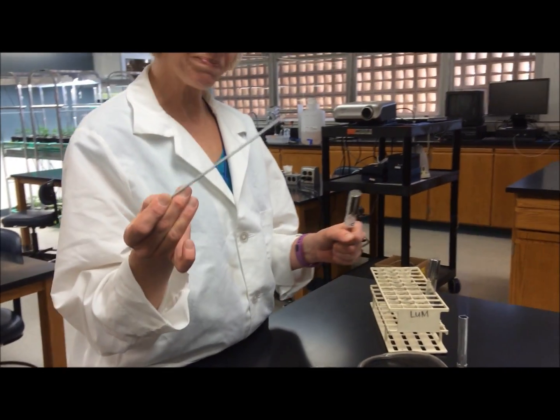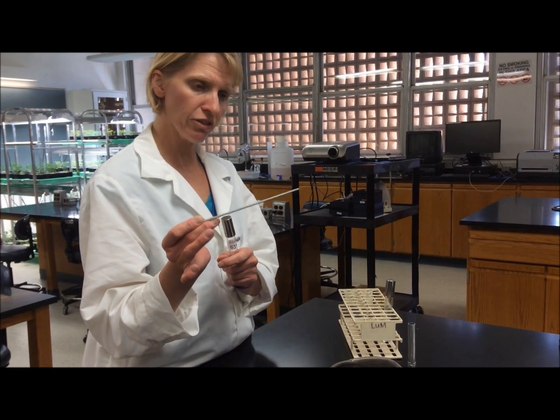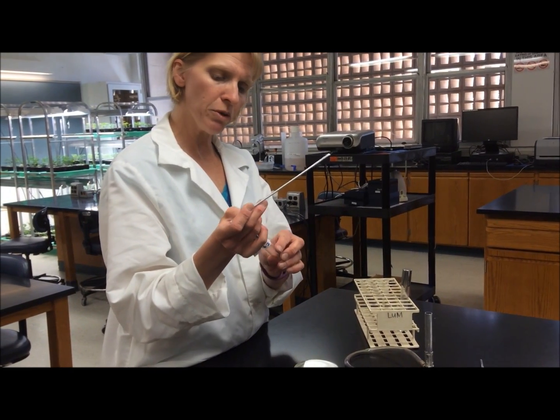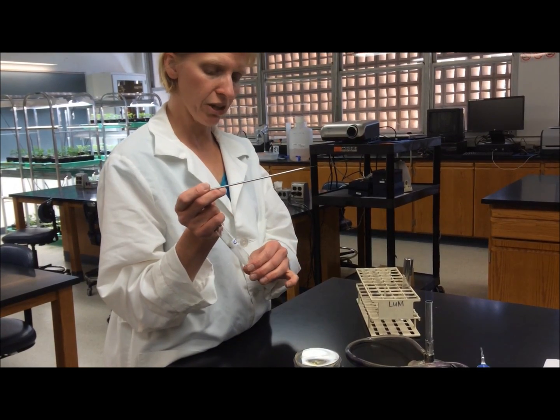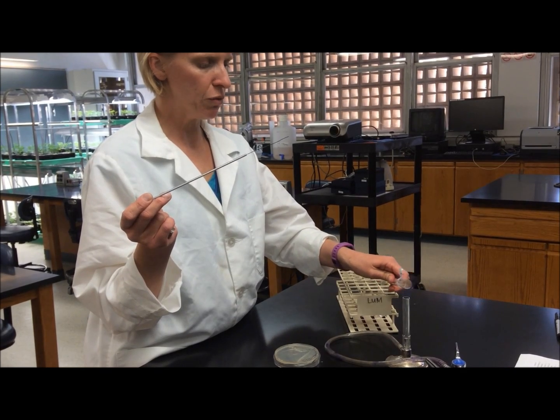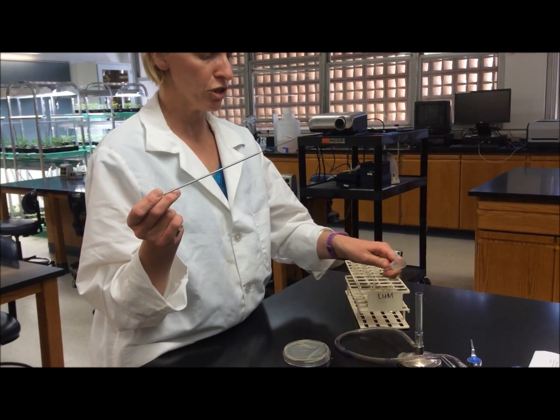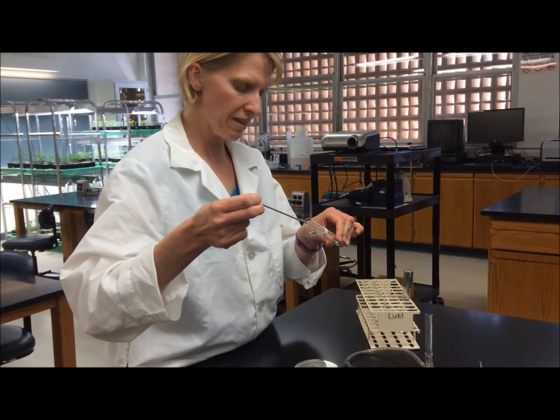The easiest way to inoculate a liquid culture, once your bacteria is on the loop, is to remove the lid of the tube using your pinky and ring finger. You then hold the tube in your left hand and run the neck of the tube through the flame just to burn off any dust before putting the loop into the media.